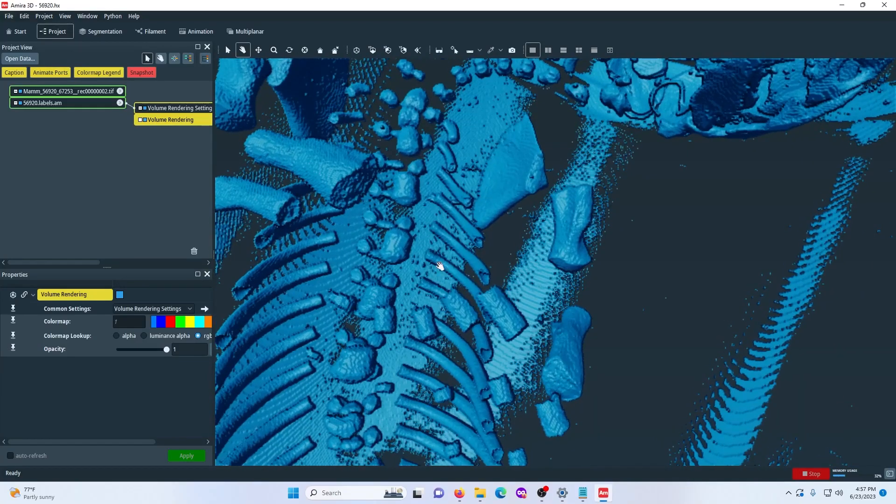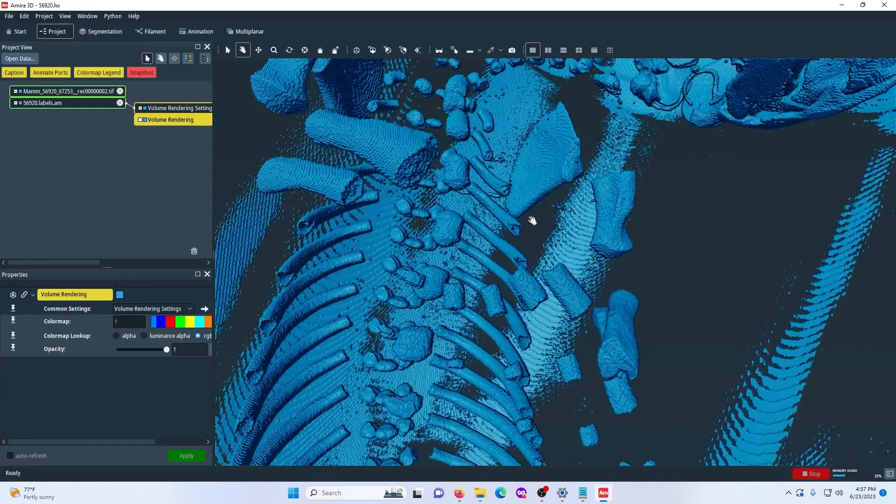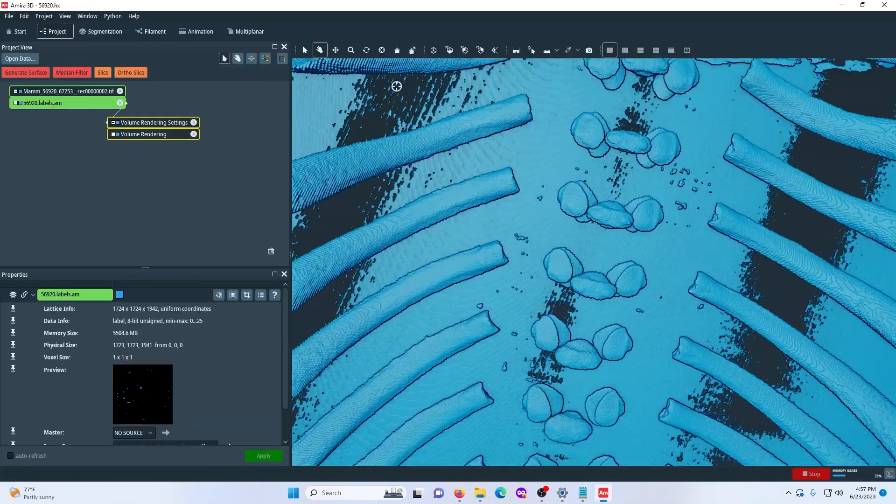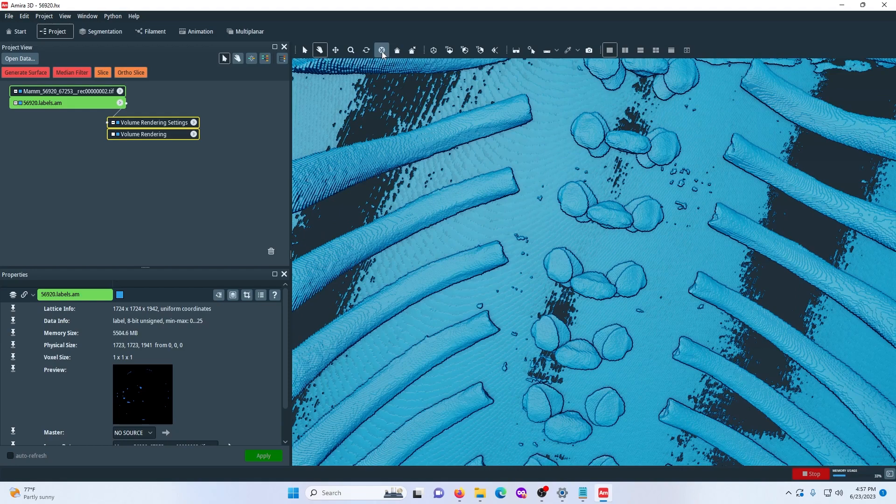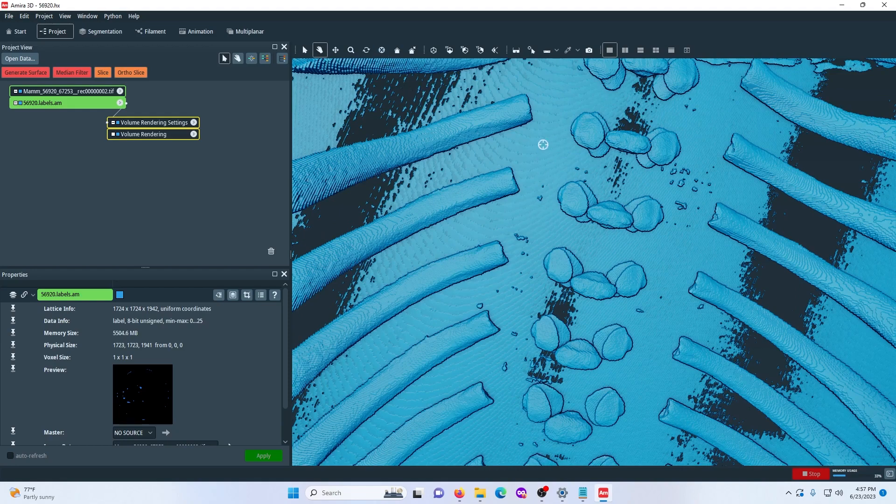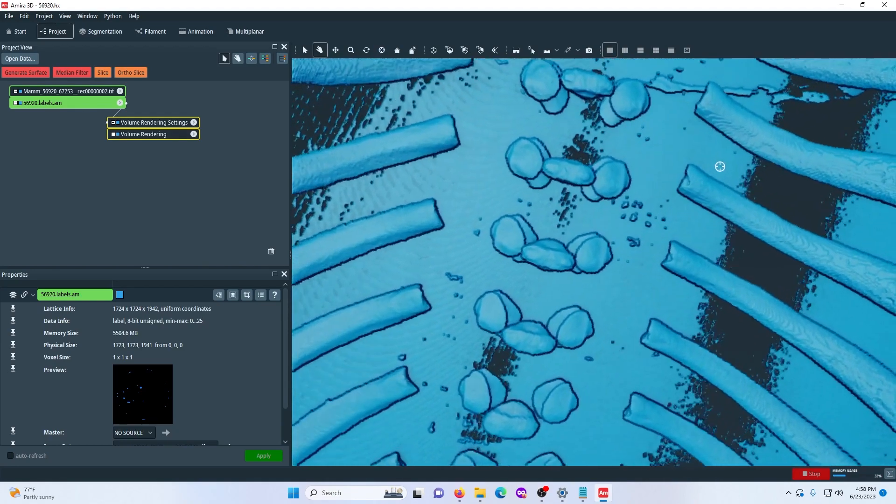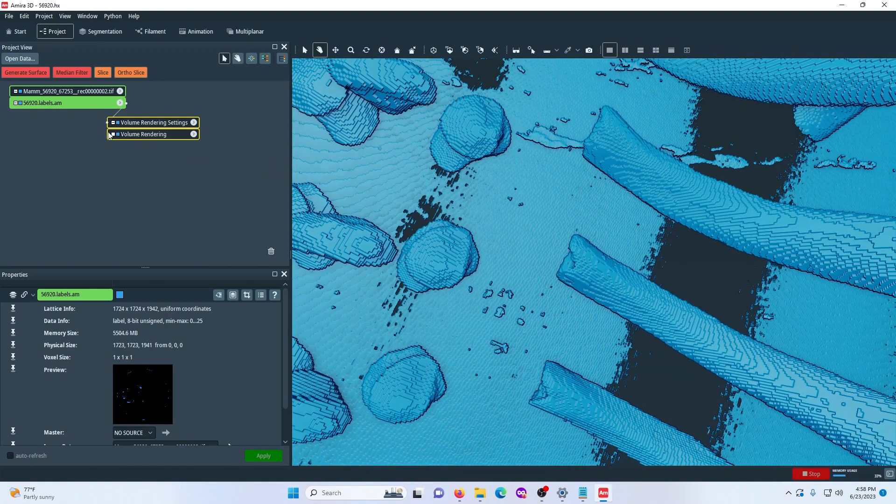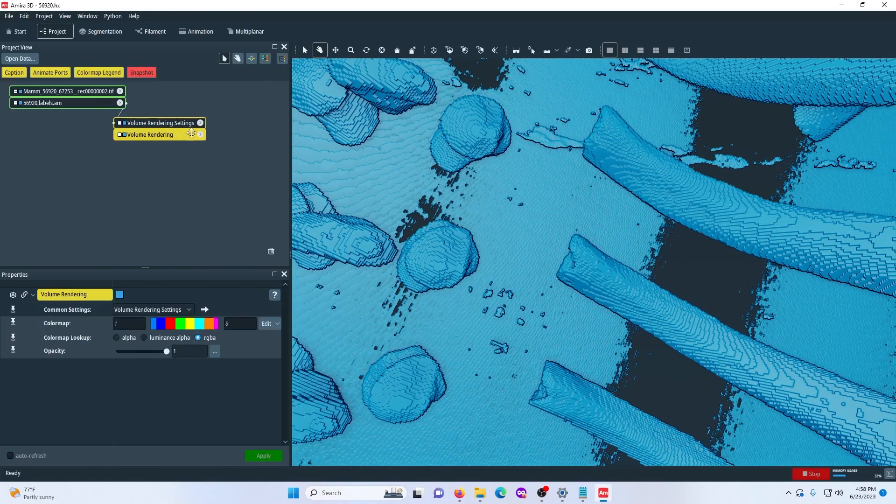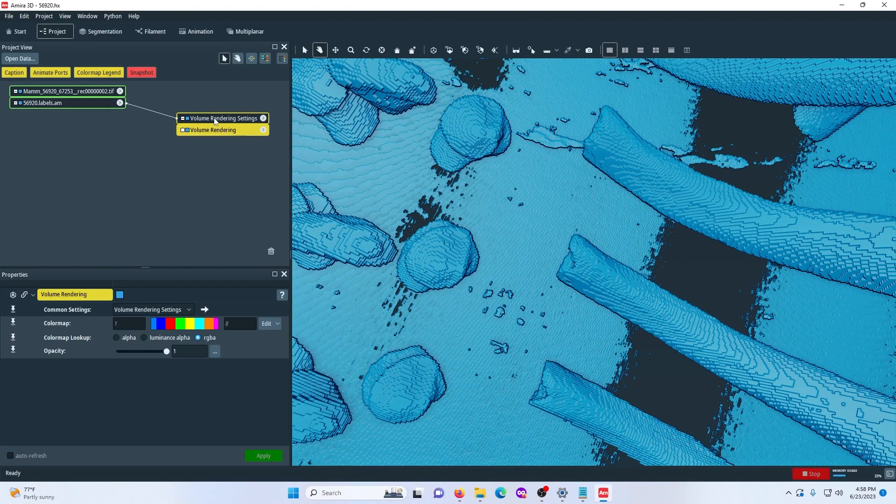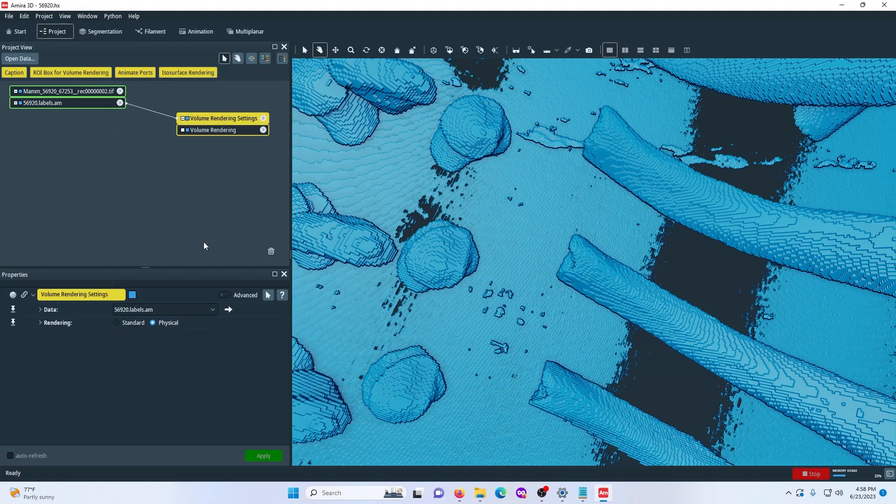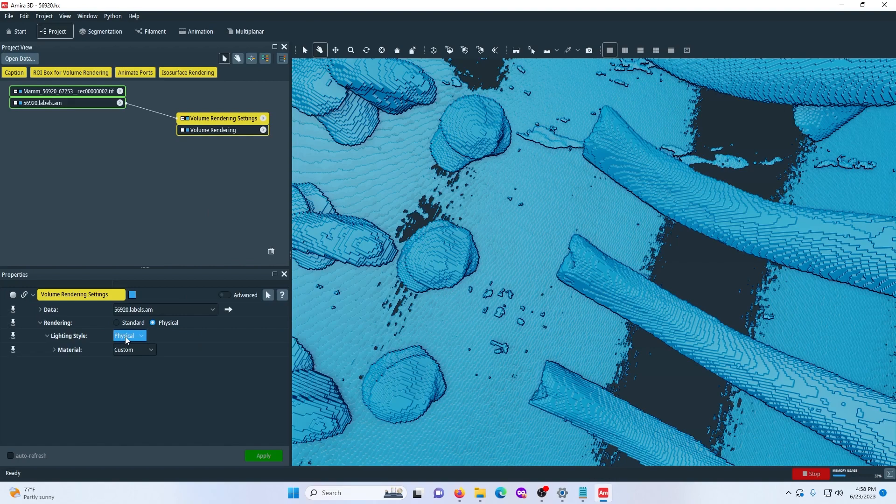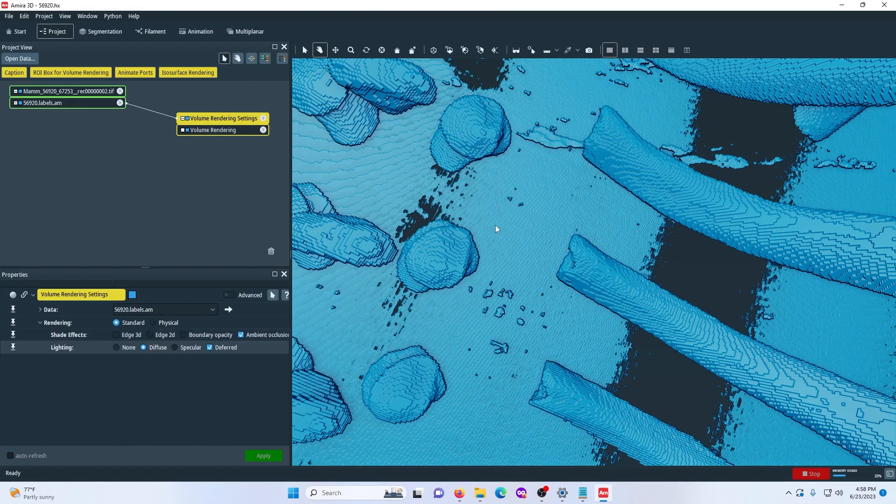You can mess around with the settings. So there's volume rendering and then there's volume rendering settings. So I go up here and you just can look through the different settings. There's different rendering styles. I think I usually do physical, but there's different options. You could also do standard and that just kind of changes how reflective the material is. It's not a huge deal.